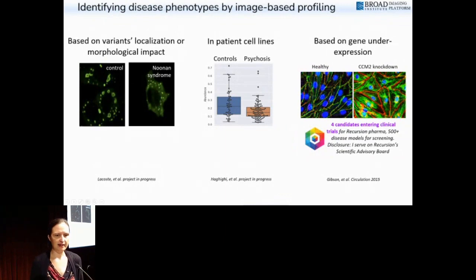Generally, you need at least 100 cells, but typically 1,000 is probably the minimum for more subtle phenotypes and the more common case. It's so cheap to capture these images that typically we have around 5,000 per sample. It's only limited by how much time you spend on the microscope capturing the images.